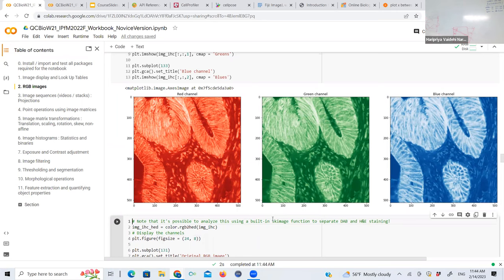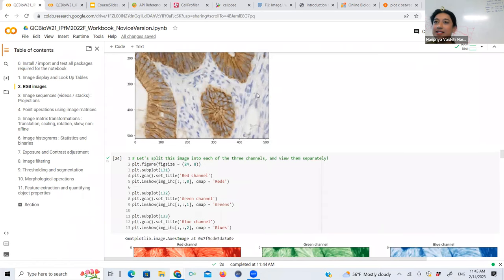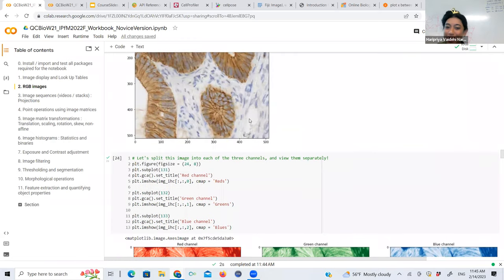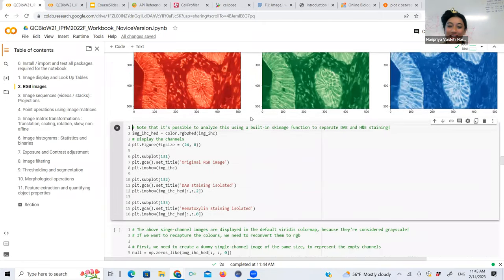What you'll immediately notice is that it looks a little ugly, right? Like, look at this. This looks so clean. It didn't exactly split it the way you would expect, did it? Is this what you expected? How many of you expected this? I guess no one. So actually, it kind of makes sense because if you look at this region, it's very red, very green, and very blue. And if you add the three together, you get something that is very white. But essentially, the takeaway is that sometimes when you split the color, it's not so obvious what you're going to get in each channel.